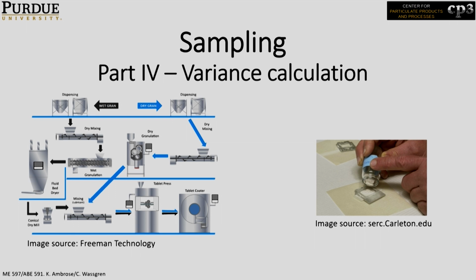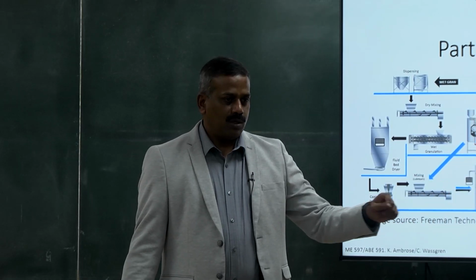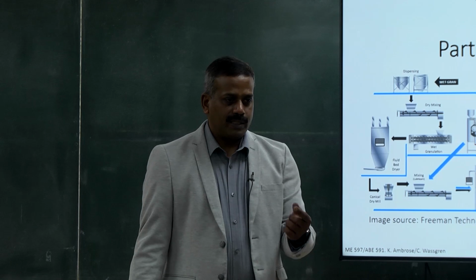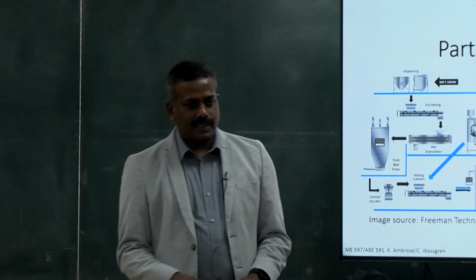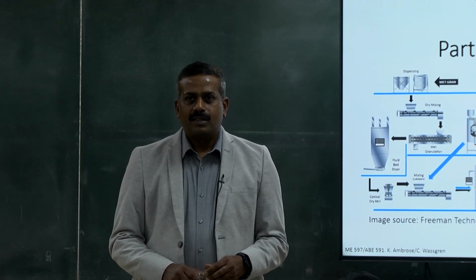Any questions? You again have to mix the sample from that particular compartment? No, you don't have to. You can keep on subsampling. So this is not sampling, this is sample dividing. After you already sample, for example, you have 100 gram of sample, and you want 2 gram from the 100 gram for particle size, then you use that spinning riffler till you get 2 grams. Okay. So this is subsampling. You don't have to do any further division. Okay. Is that clear? Any other questions?